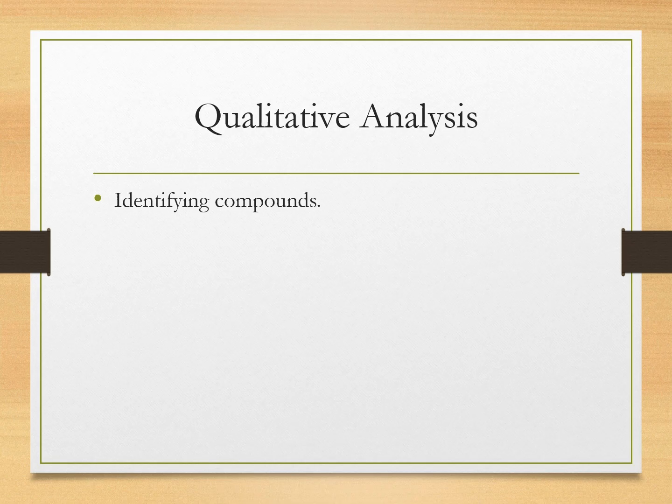For example, if we want to know the compounds in a plant, then phytochemicals can be studied by using the lambda max. If we adjust to the lambda max, then we can find out the concentration.